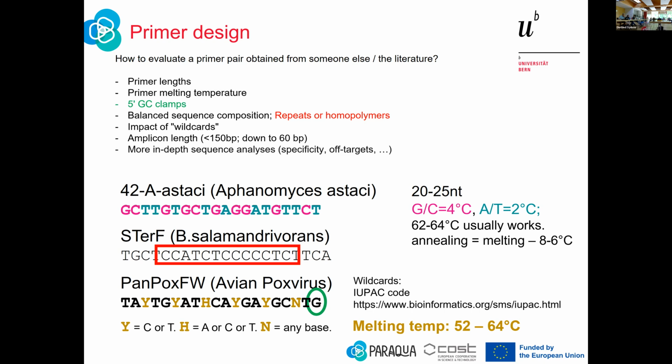I will not go into the primer design business because this will take an afternoon of workshop. But there are many more questions to consider. Really know your primers. Do not just take somebody's primers, apply them, and never question the assay.